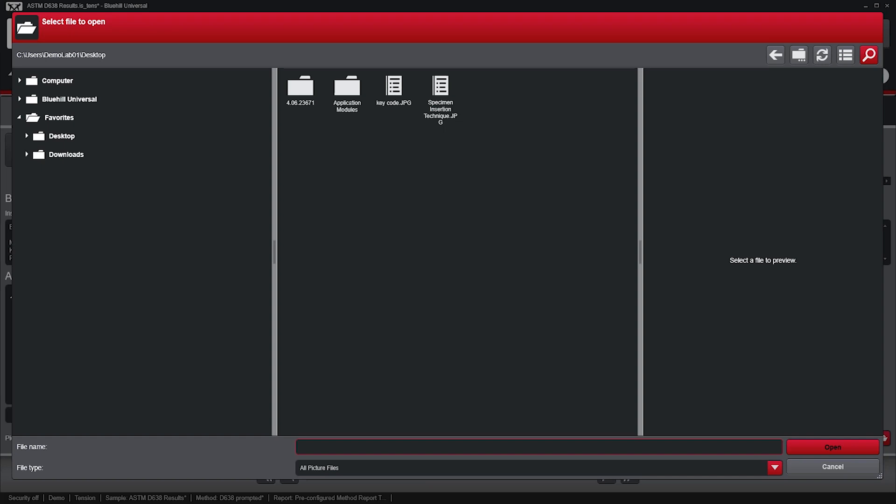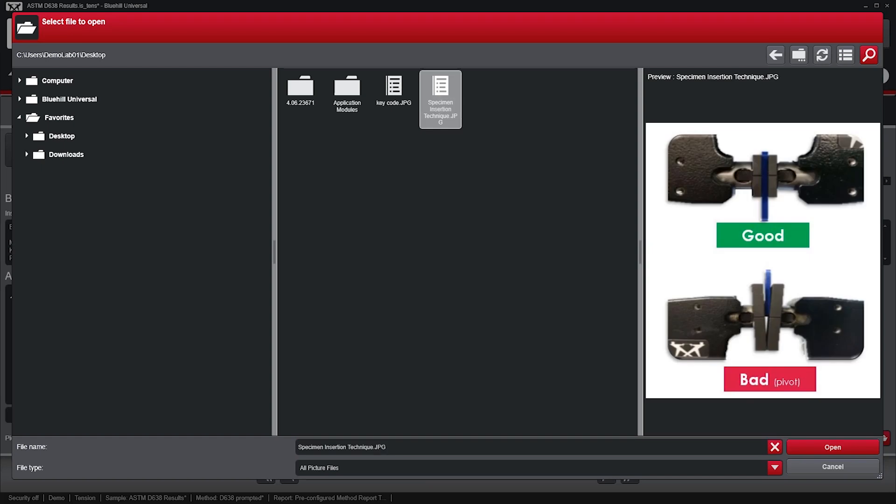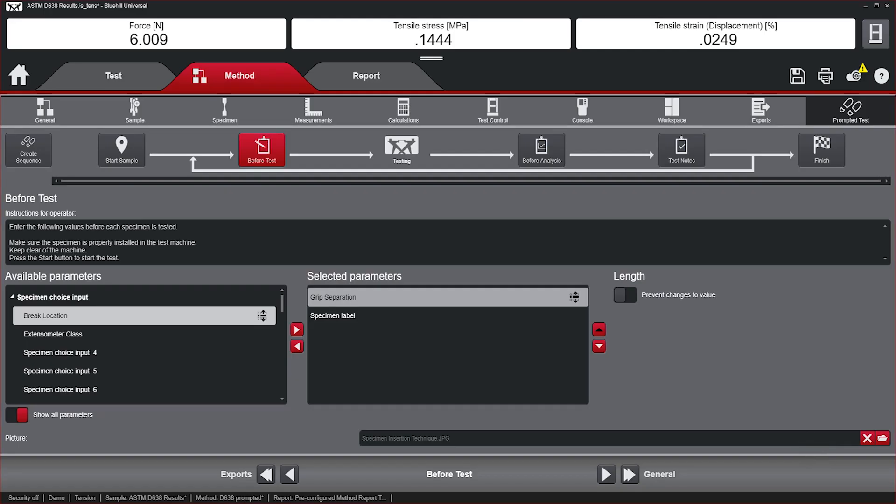Additionally, you can add a picture file to visually guide users on proper test setup, preventing issues such as specimen misalignment.